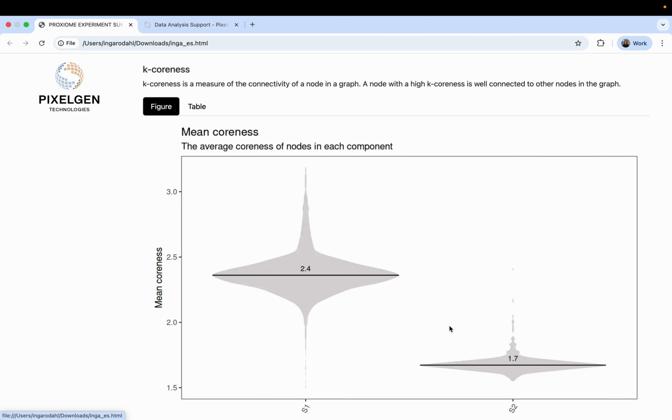For example, for the B cells, you see that we have these different networks of proteins that seem to be changing when you go between different conditions. And this includes this network with CD19, CD21, CD72, which are all markers that are important for B cell function. So this allows you to get an initial overview of what might be happening spatially on your cells.